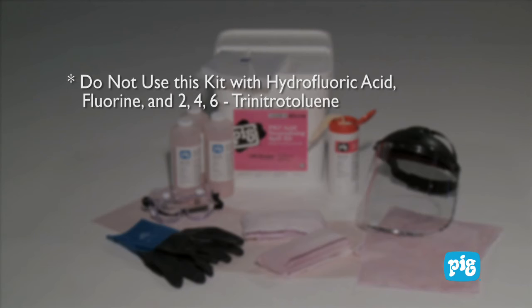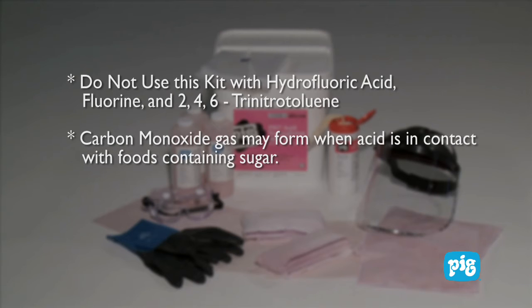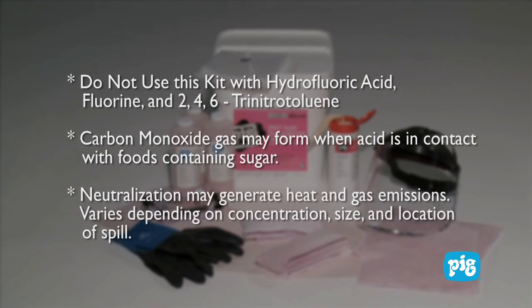Do not use this kit with hydrofluoric acid, fluorine, and 2, 4, 6 trinitrotoluene. Carbon monoxide gas may form when acid is in contact with food products containing sugars. Neutralization may generate heat and gas emissions. This varies depending on concentration, size, and location of spill.